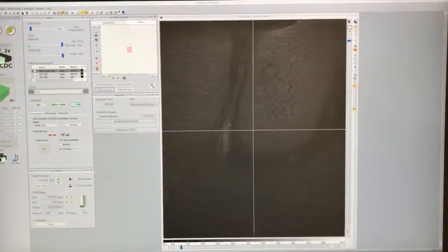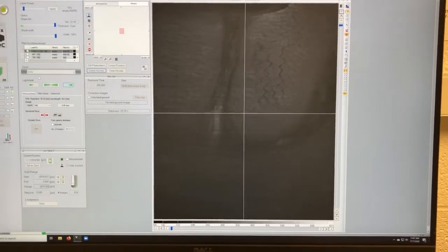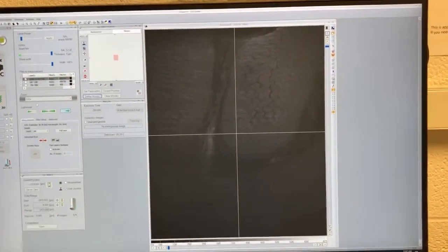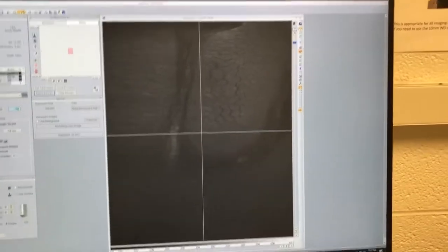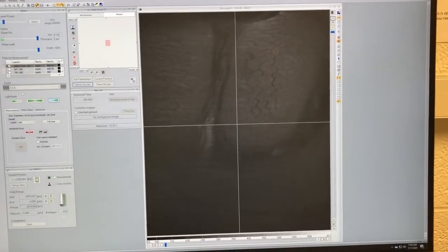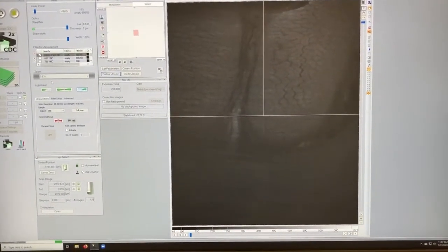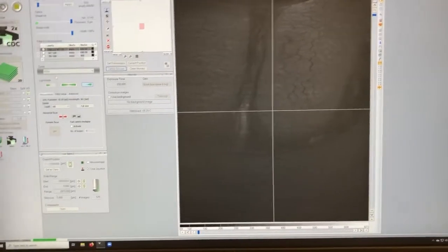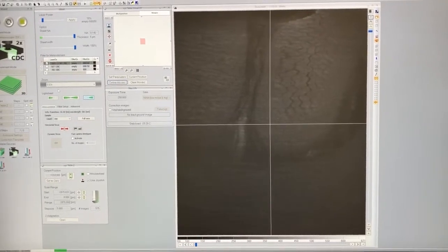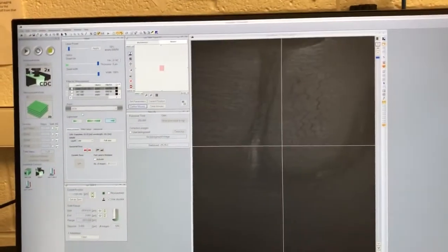You may or may not want to do tiling. Another option people use is to take images at low zoom, and then if they don't need all that detail everywhere, they can take a more zoomed-in z-stack of a small area. You can take a very zoomed image of a large sample, you'll just need to tile a lot. The main consideration is the level of detail you need, then it becomes a question of how much time it's going to take and whether you really need that level of detail.